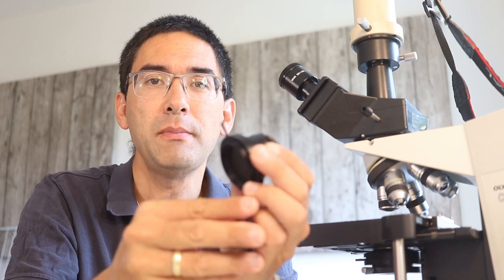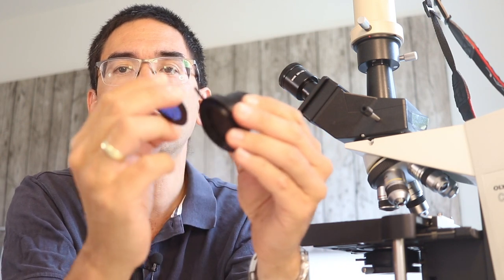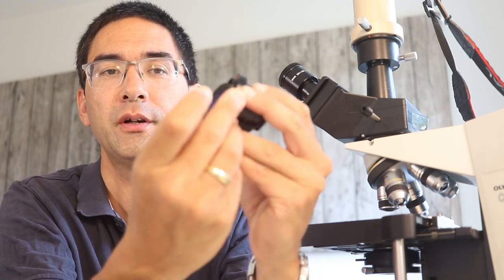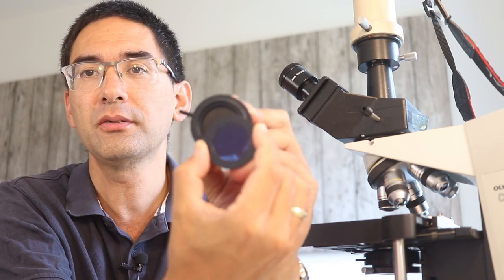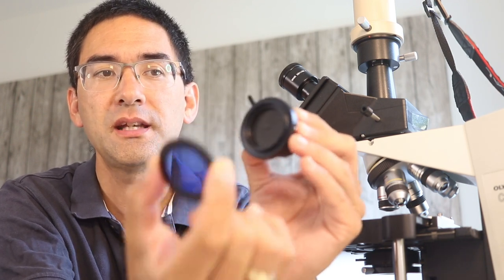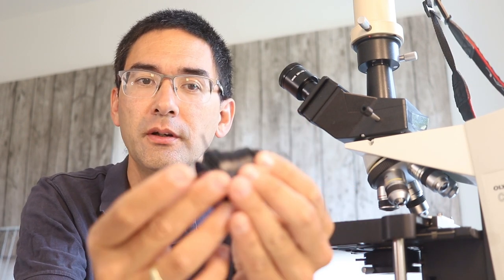Also check the filter holder. Many condensers have a swing-out filter holder with a hinge. If it's not positioned correctly, the edge of the filter can block the light — this is actually one of the reasons why some people can't see anything. Make sure the filter is in the correct position over the condenser.